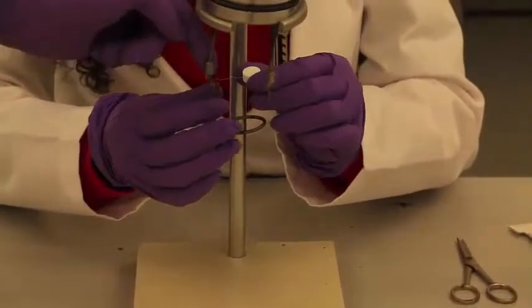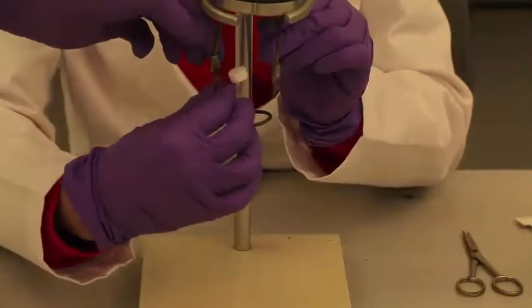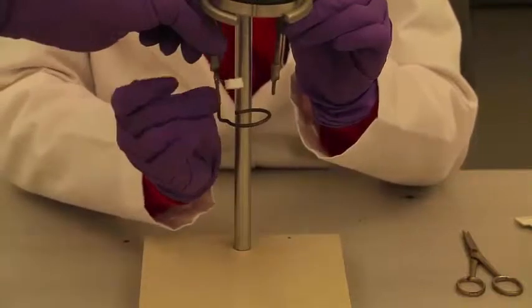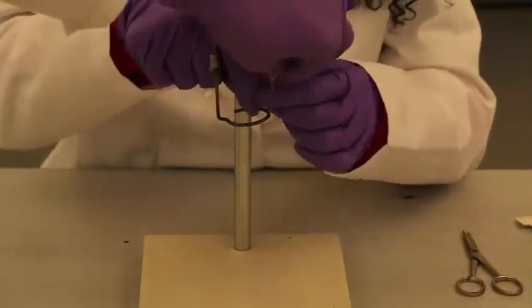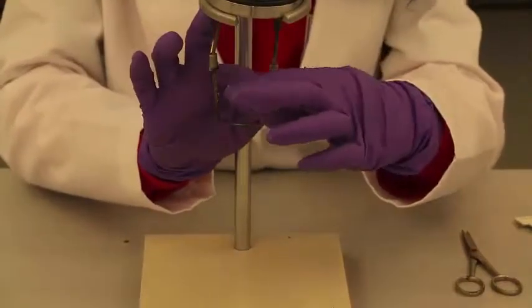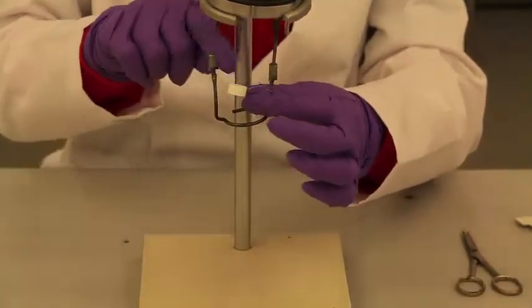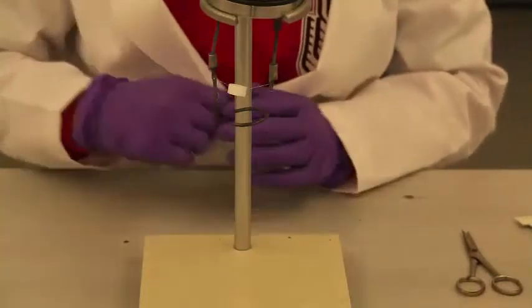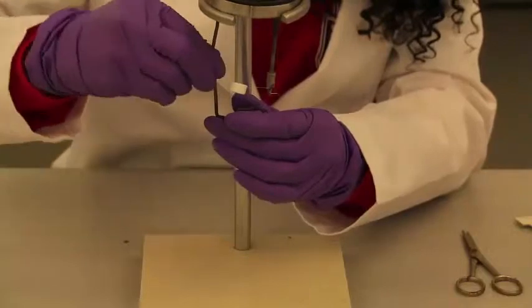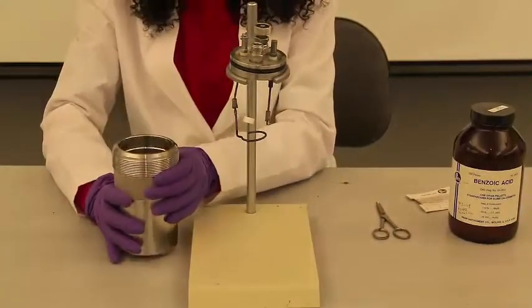Place each end of the wire through the small holes in the leads. Wrap the wire loosely in a downward spiral fashion. Repeat on the other side. Pull down the covers of the leads. And mount inside of a clean bomb.